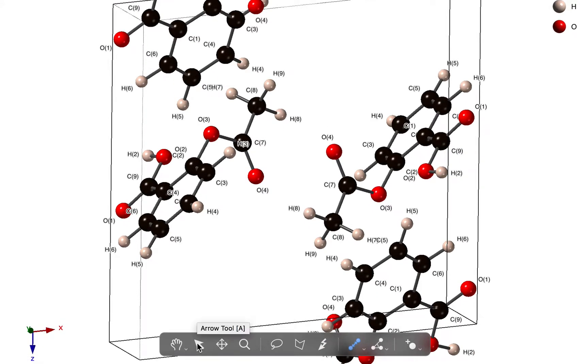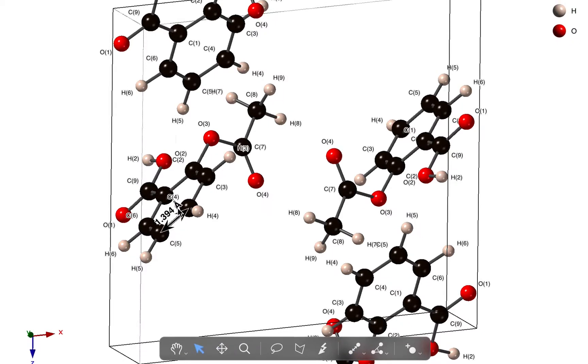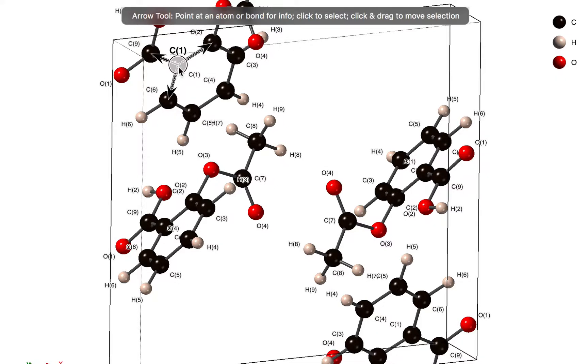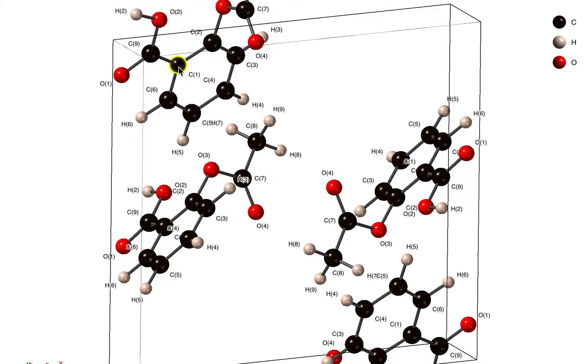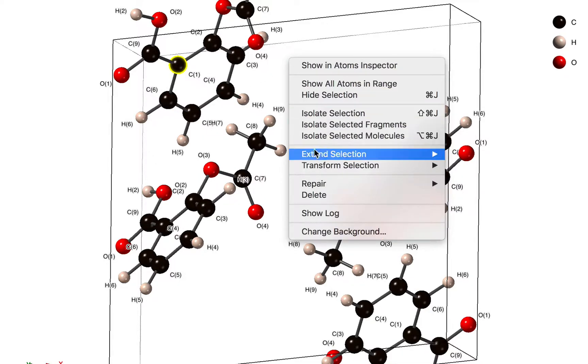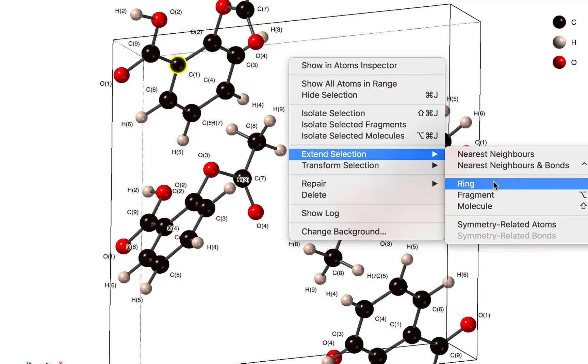So there's an easy way of doing that in CrystalMaker. We're going to switch to the arrow tool and I'm going to select one atom in the ring. I can shift click on the other atoms to select them, or as a shortcut we can right click and we can extend the selection to the entire ring.